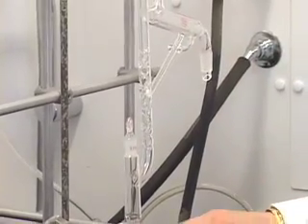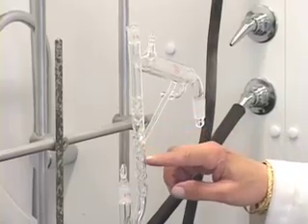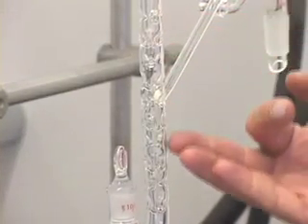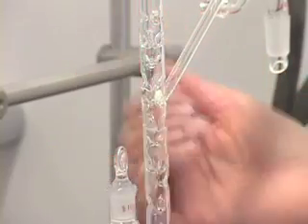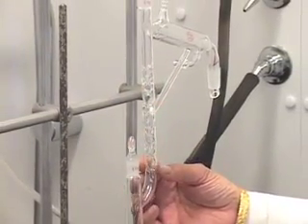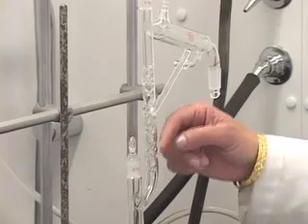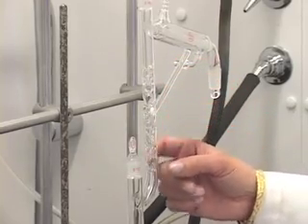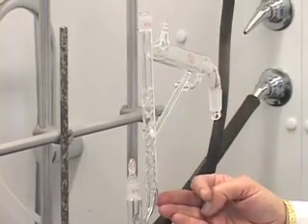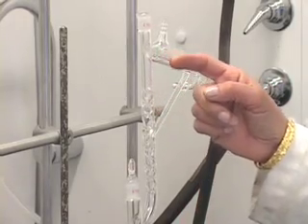When you heat the liquid, the vapors go through this portion of the column. If you notice, there are indentations inside this part of the distillation head. This type of column with glass indentations inside is called a Vigreux column. It effectively performs multiple simple distillations, enabling fractional distillation by providing a temperature gradient — warmer at the bottom, cooler at the top — so only the lower boiling vapor gets out first.